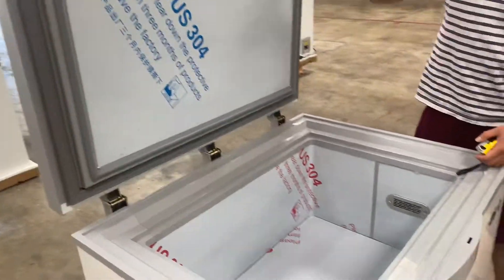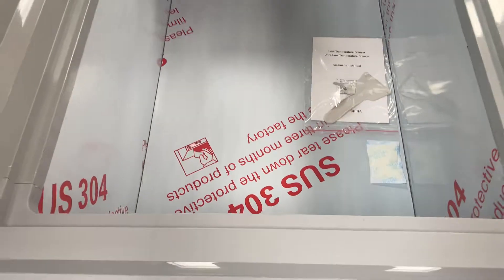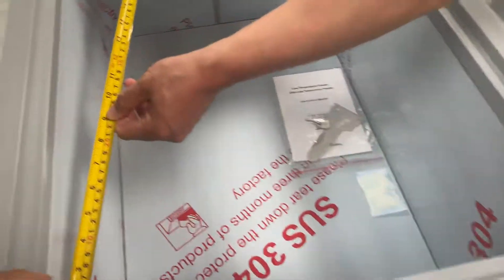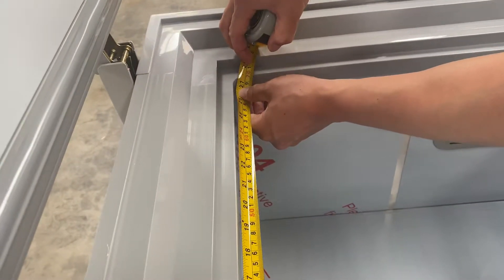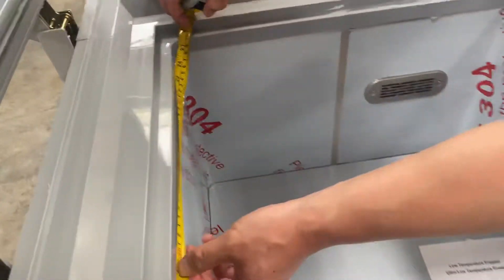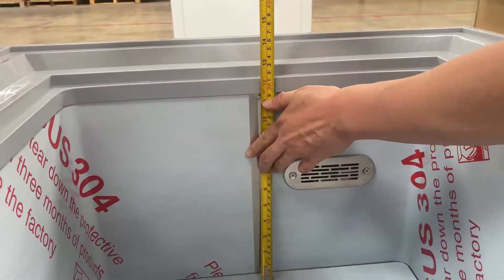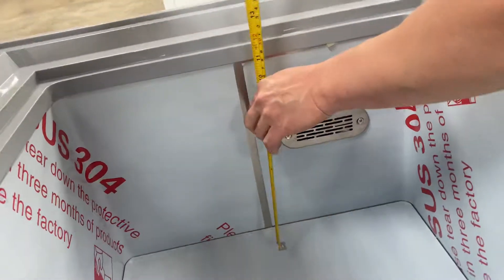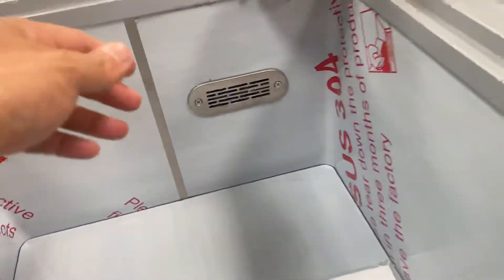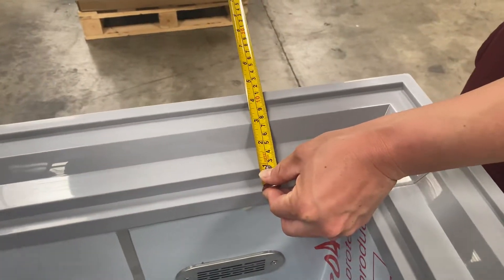Here is the storage compartment for the vaccines and any medicinal purposes. The dimensions for the interior box: we're looking at 27 and a half inches in width, 12 and a quarter inches for the height, and for the outer wall lips we're looking at four and a half inches.